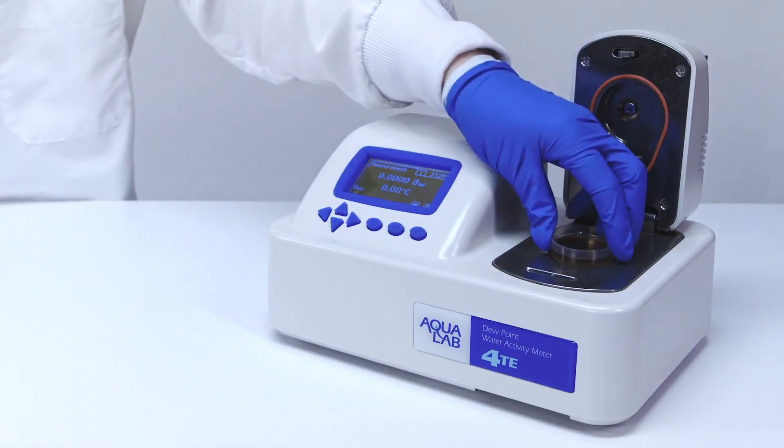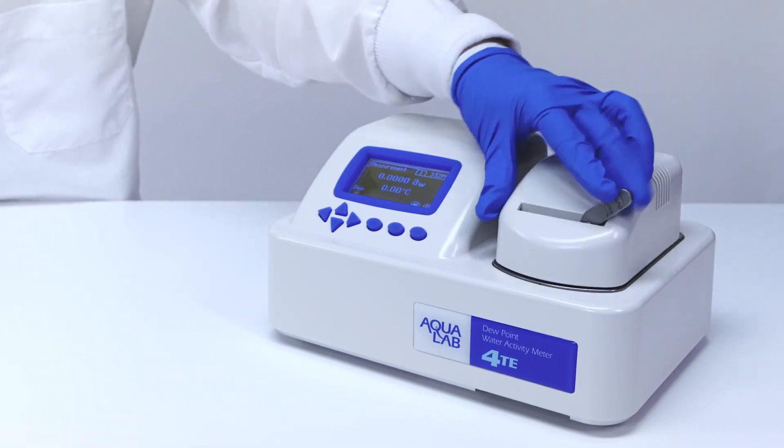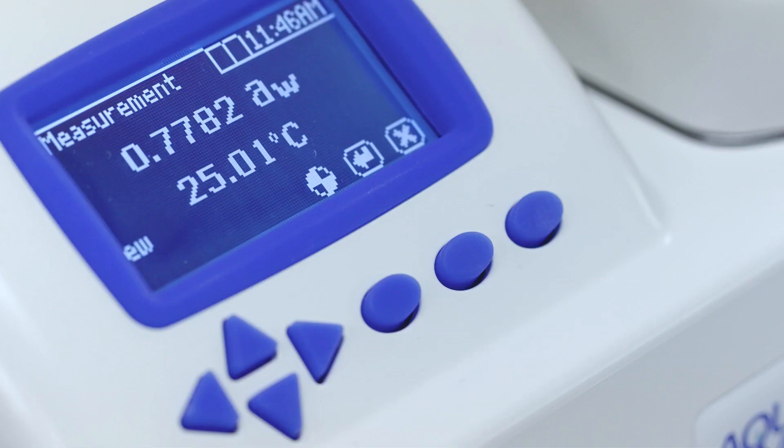Once the sample is ready, the 4 TE is ready to go. This gives it a typical read time of five minutes or less.